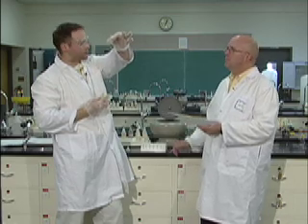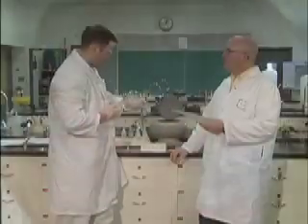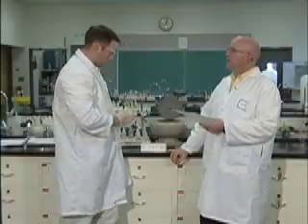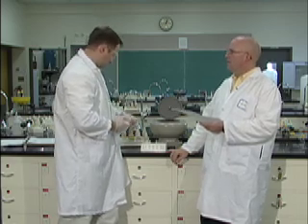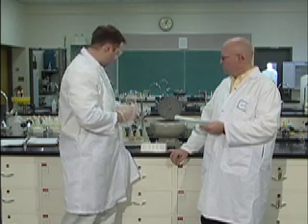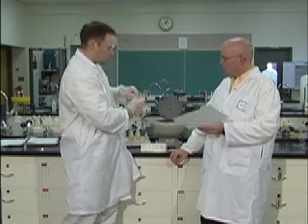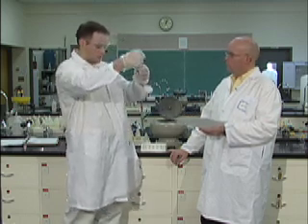So now we know for sure that we have silver cations in solution and that we have iron cations in solution. Then you're going to go back to your decant and do more tests on that and more tests until we determine exactly which of the ions are in there. Exactly. So now we've got our decant, and now just to show that we actually do have aluminum in here as well, I'm just going to add hydrochloric acid once more.